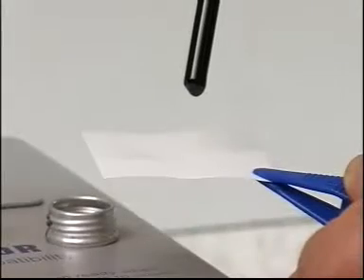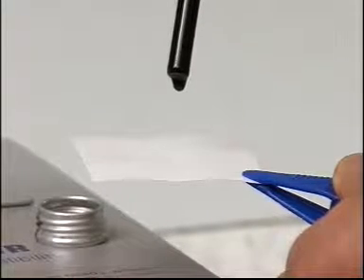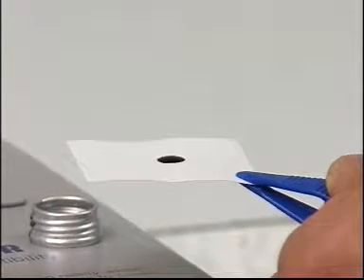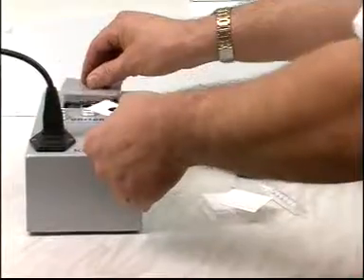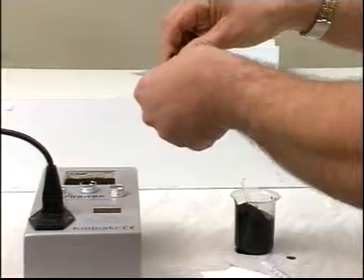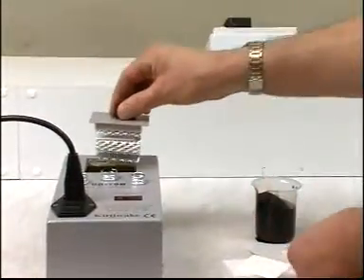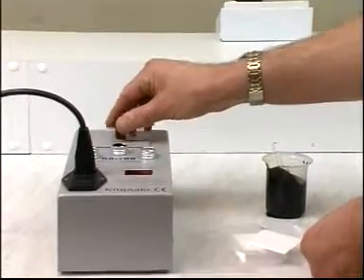Let the first drop fall back into the tube and direct the second drop so that it falls onto the center of the test paper. Place the paper in the removable tray section and replace it in the oven. Reset the timer and wait for another 20 minutes while the spot dries and develops.